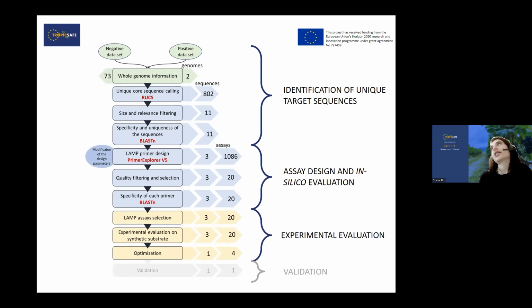Experimental evaluation is actually quite important in the LAMP design process, because in silico evaluation doesn't necessarily tell us what will happen with those assays in experimental settings. So even if assays look very good in silico, they might not perform as well in the experimental evaluation step.